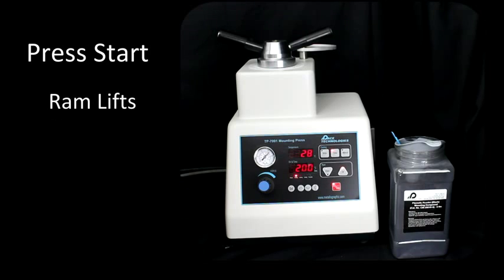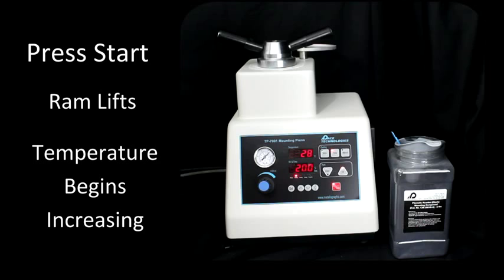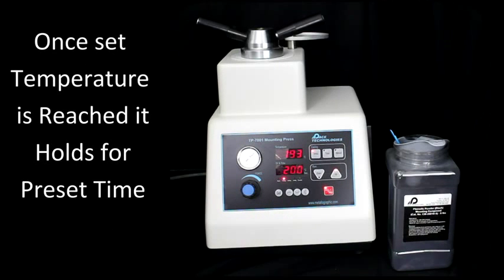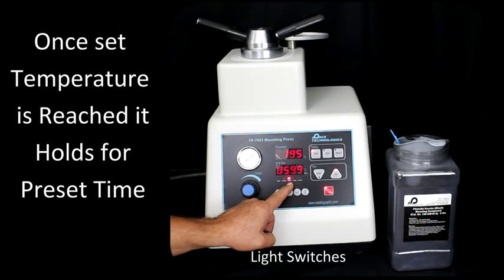It lifts up the ram and the temperature will start to heat up here. Once we reach temperature, you'll see this light will click over to this light. So now we have a holding time of 600 seconds because we set it for 10 minutes.